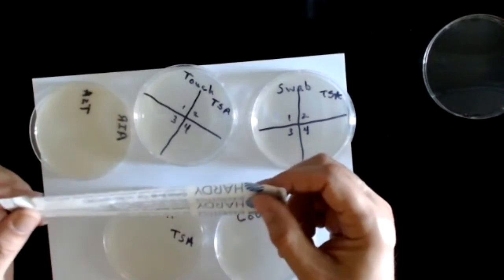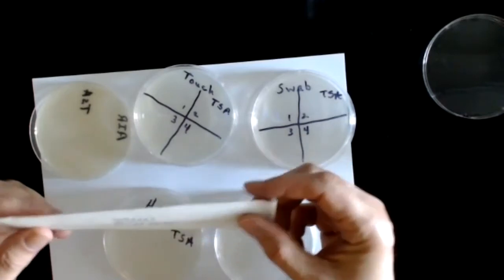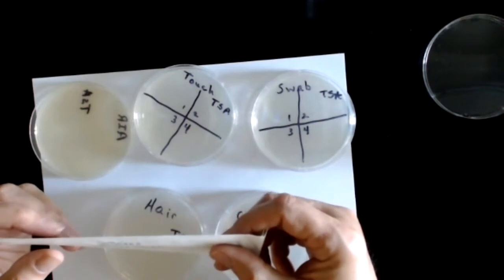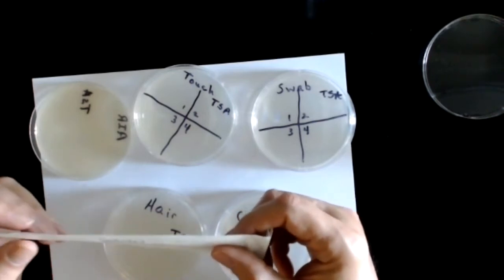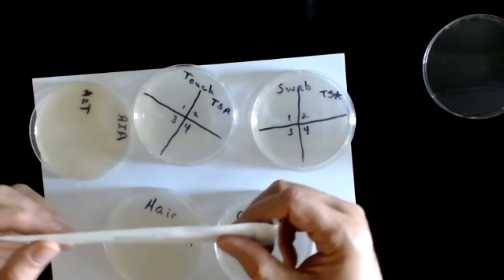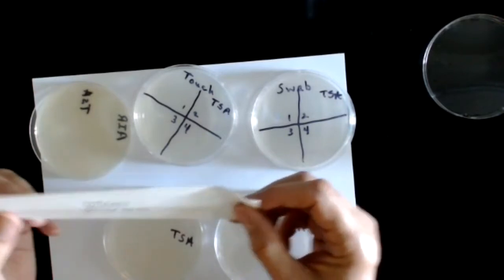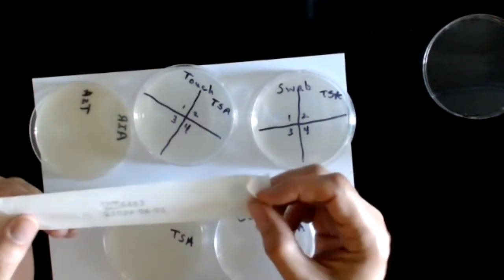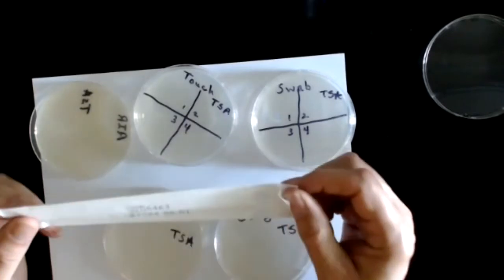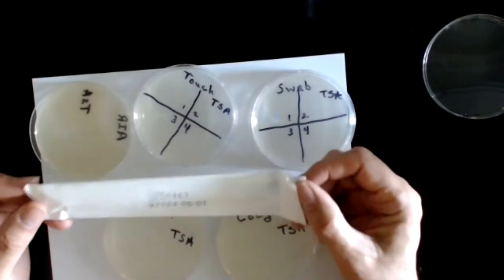The swabs are bought enclosed in a sterile paper bag. Sometimes there'll be 2 swabs in a bag. Oftentimes there's only 1. The swabs that we purchase here at Trinity have only 1 swab per bag. This swab is sterile until I open it. Once I open it, it is possible that it will become contaminated. So you never want to open up your swabs until right before you're ready to use them.